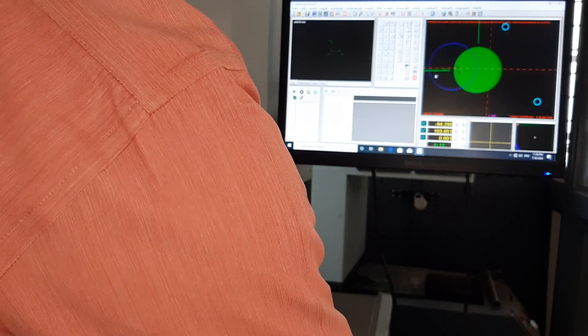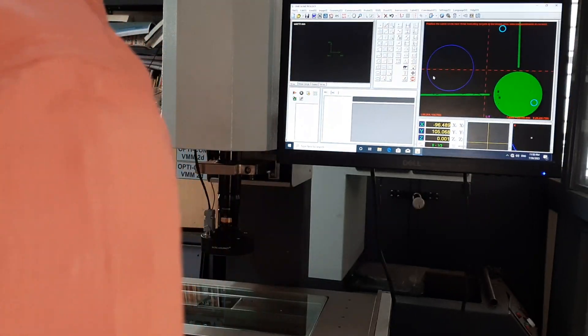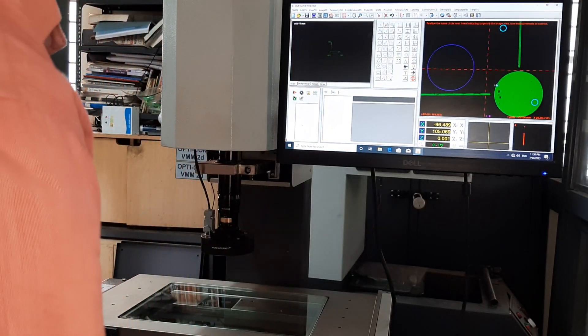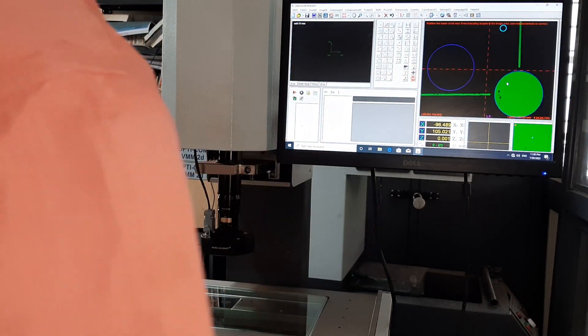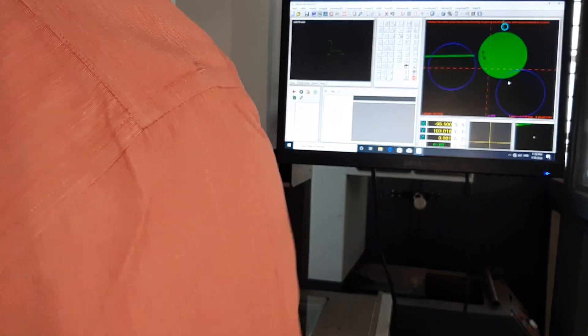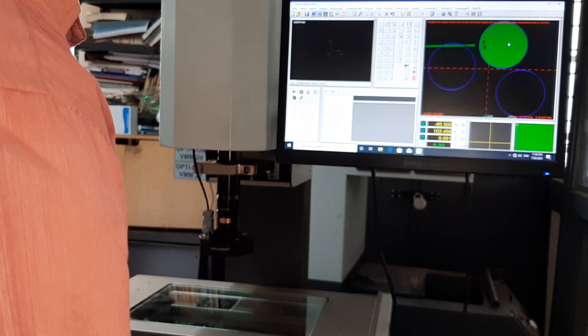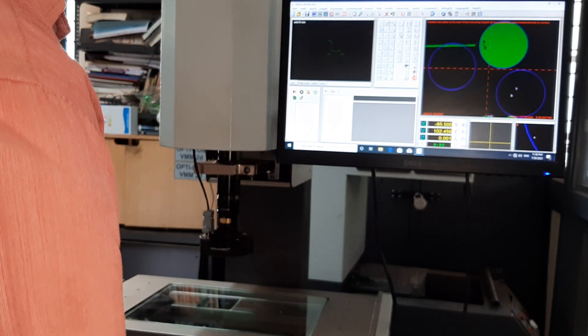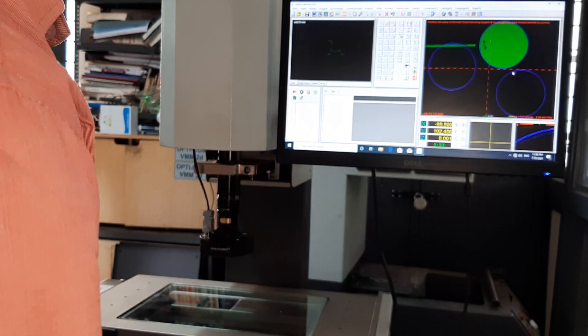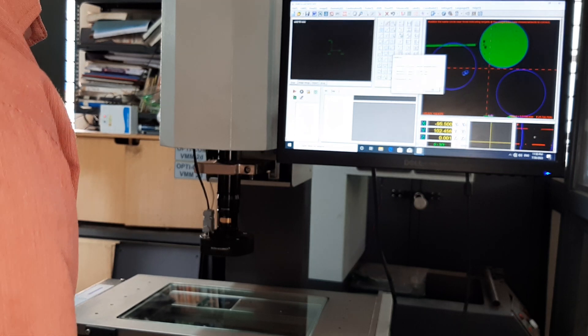Move the same circle to the other circle. Left click. Move the same circle to the other circle. Left click. And now after selecting the three circles, make a right click.